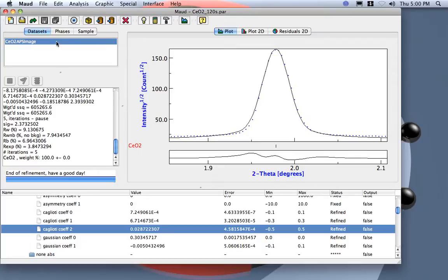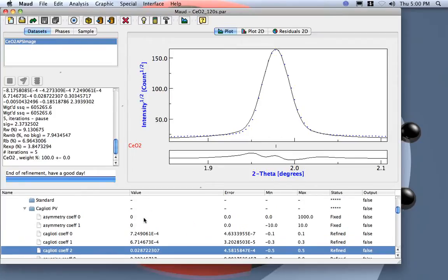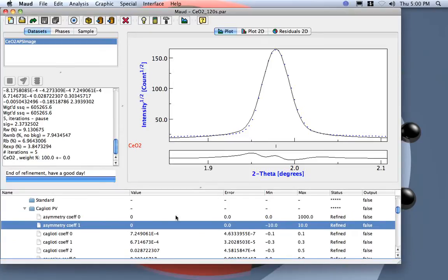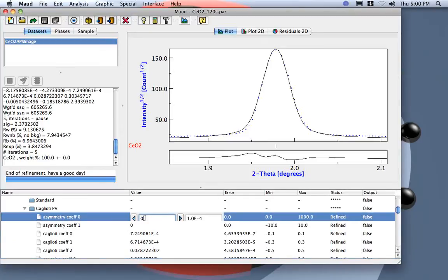So how do we do this? We can actually do the following: we can refine the asymmetry here. Let's start from some real values, not zero zero, but from some real value.